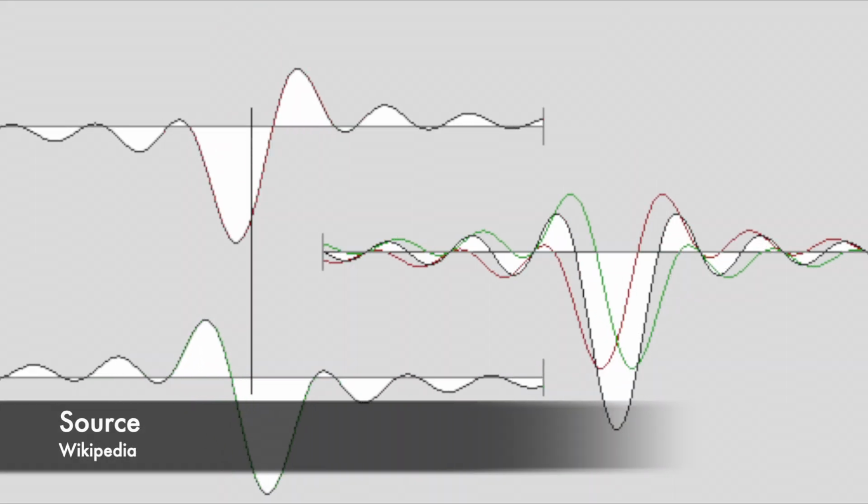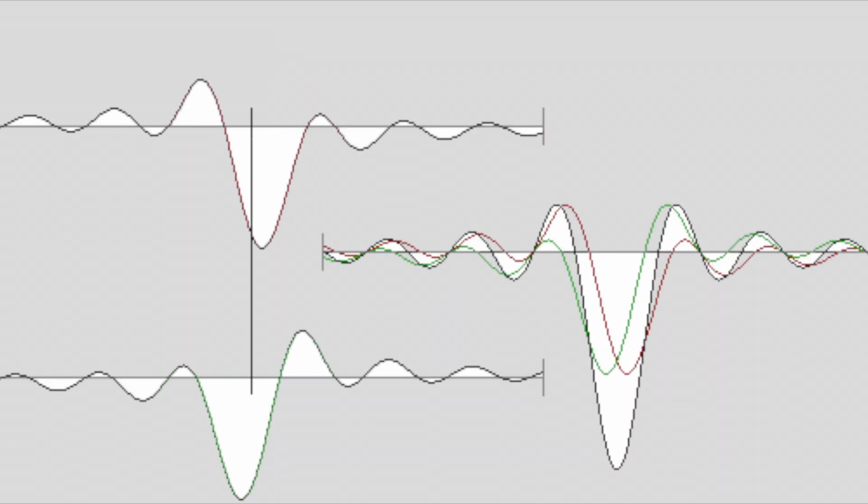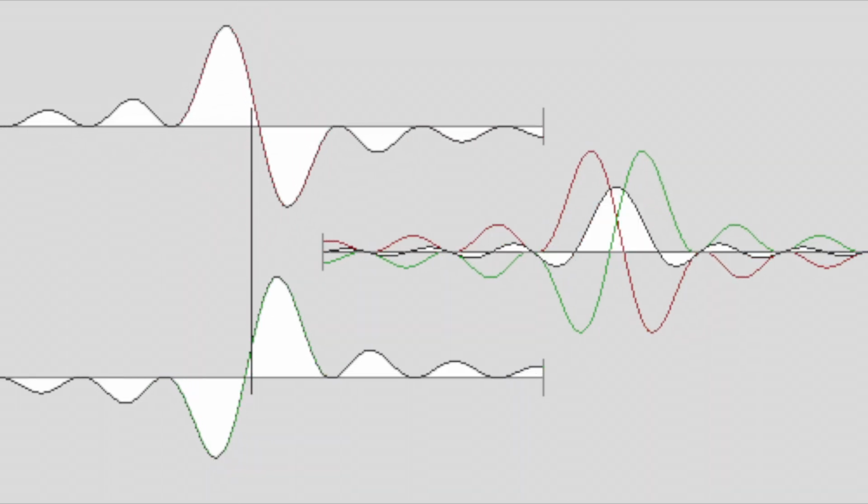so they can give us a lot better resolution. But now thinking about how electrons are shifted when they're being fired at a receptor, and how it's actually detected that these electrons didn't just go straight through the ice and actually interacted with the receptor, you can look at the phase of that electron to see if it's different from before it interacted with the sample and after. So essentially, I'm showing this GIF here, and what you can see is we have these two waves that are right on top of each other, and then the one in the middle is the summation of both of them.